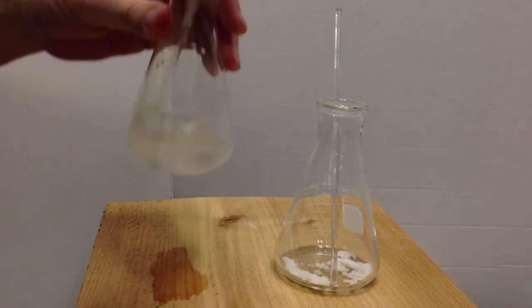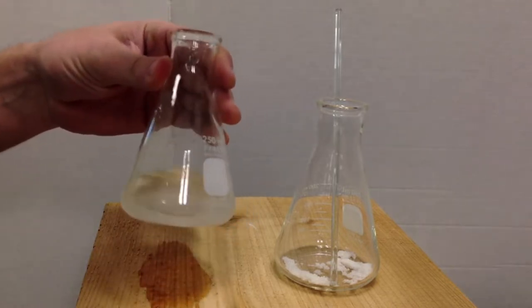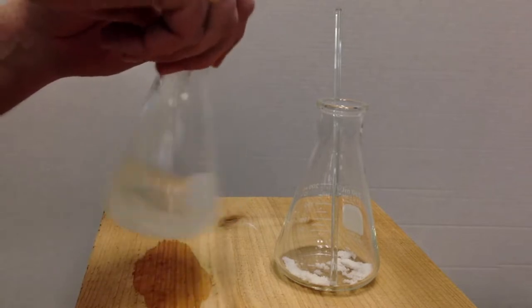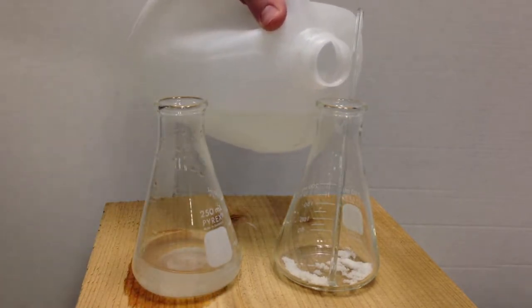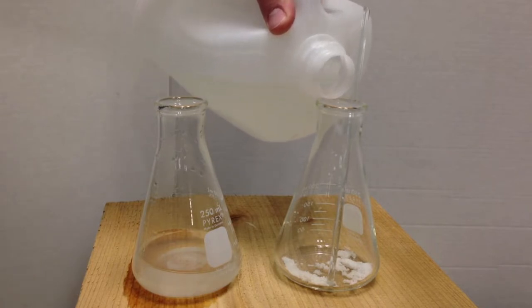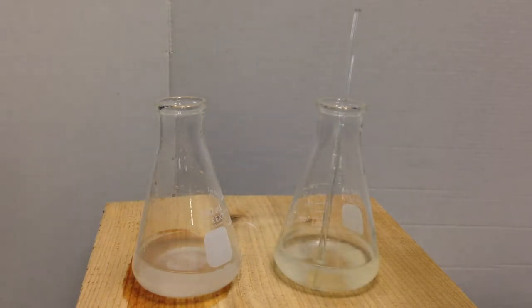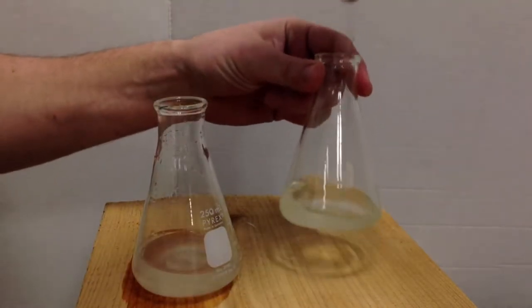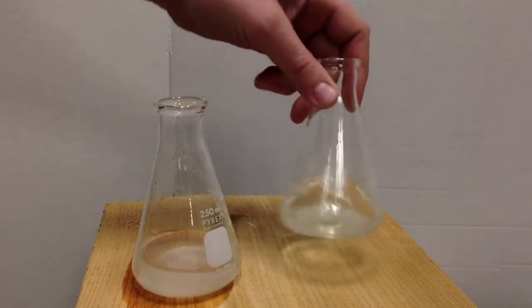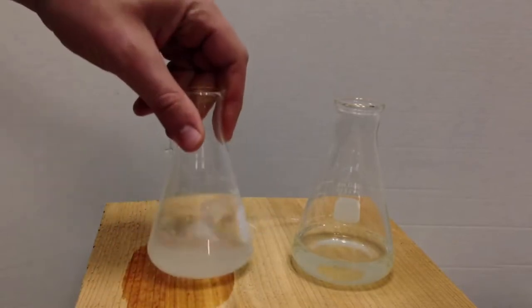Mixing, you can see that it makes a solution. And it does dissolve. It is definitely aqueous. And same thing with the potassium iodide. Hopefully it'll make as much of a mess. This is the KI, adding some water. Also making an aqueous solution. And both of these salts are soluble in water. So they stir. And I have two aqueous solutions. You can see through them, and you can see the solids have now been dissolved.